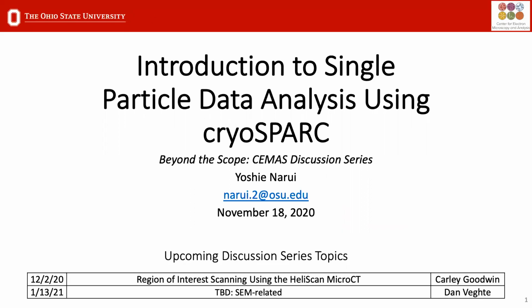So the one thing that you should notice, especially in this sentence here, is that you're trying to recover the high resolution information. And you'll notice that the frequency of the oscillation increases with resolution. So what does that mean? It means the closer you are to focus, that's where the highest resolution information is going to come from. But the issue is the closer you are to focus, the less contrast you'll have in your image, so it'll be more difficult to select particles. So it's a little bit of a trade-off.